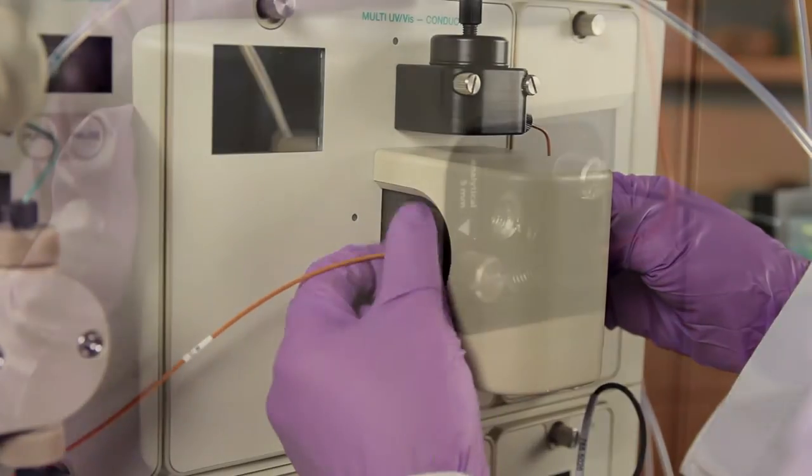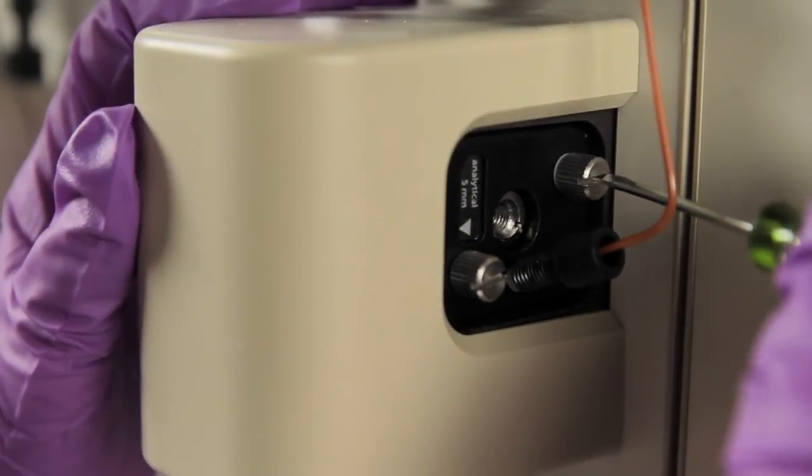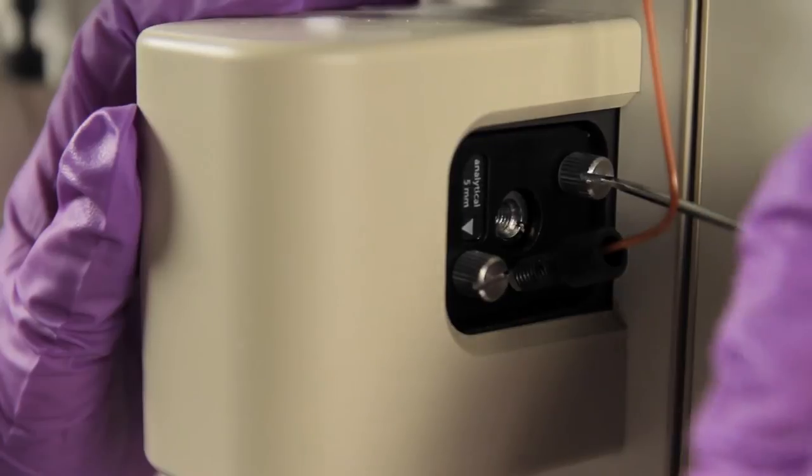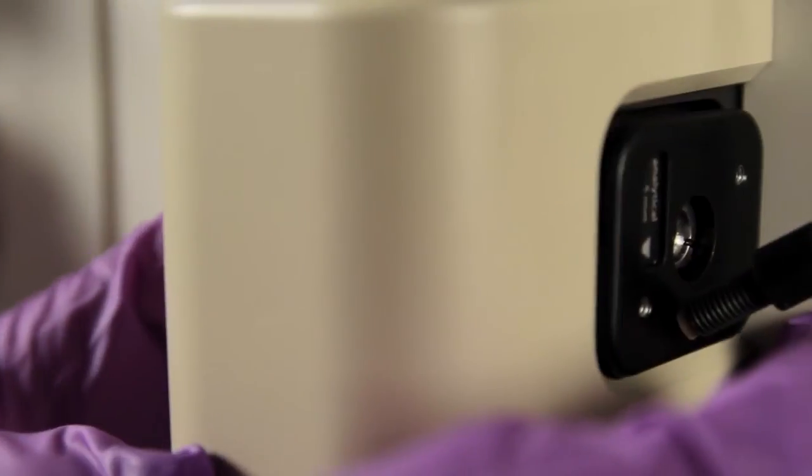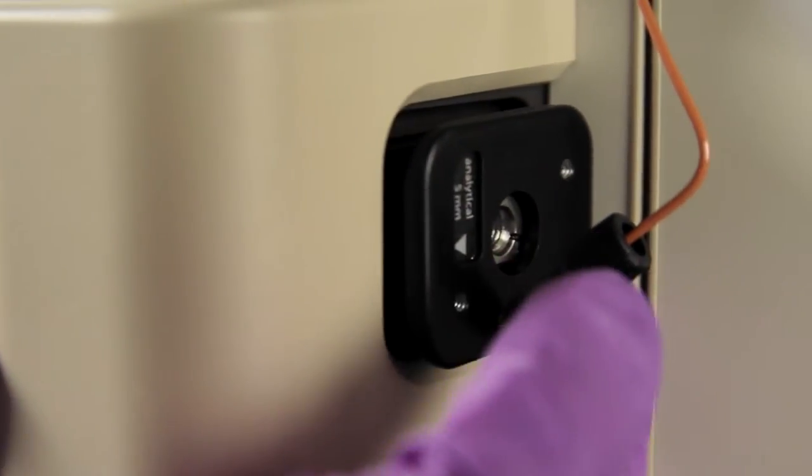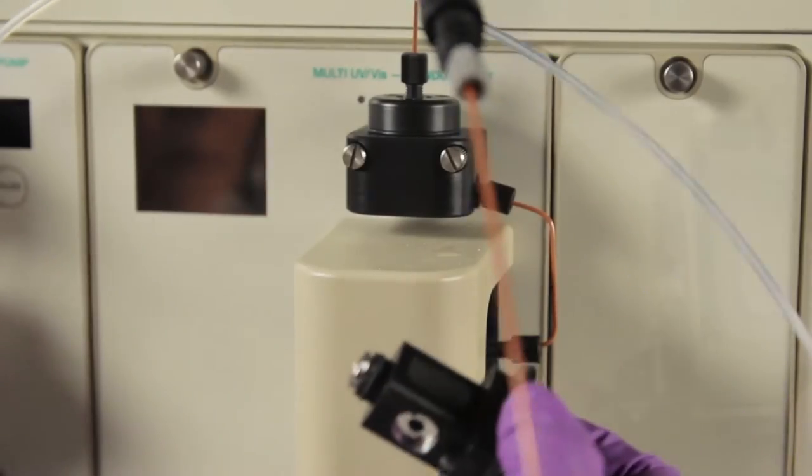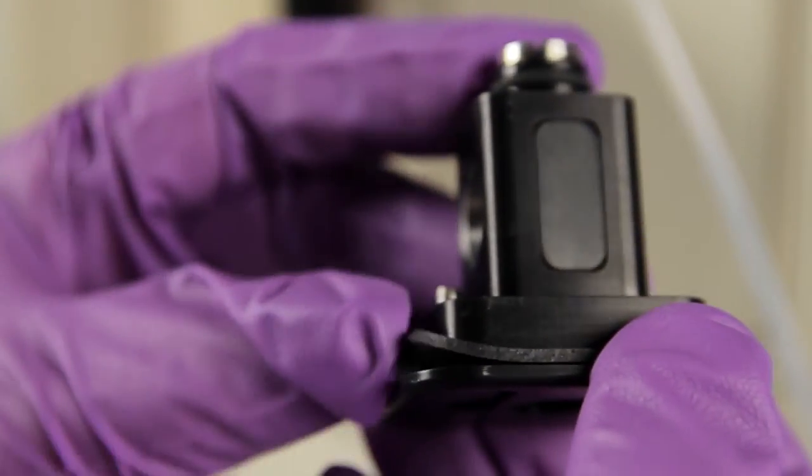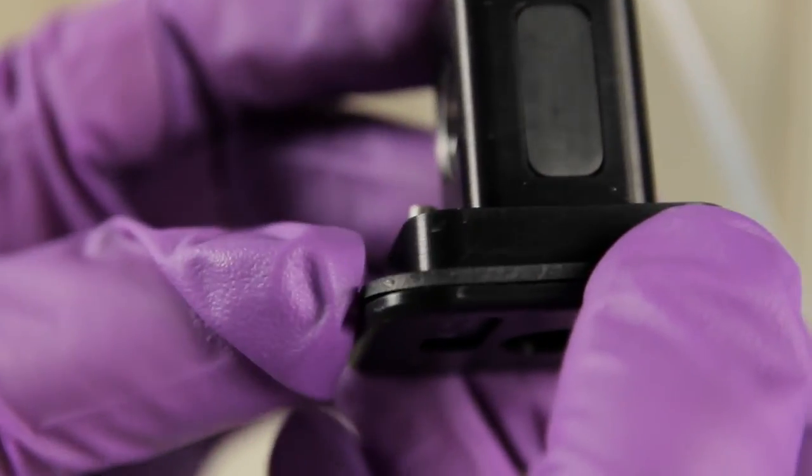Using the screwdriver supplied in the fittings kit, loosen the two thumb screws holding the UV cell and push the flow cell to the right to remove it from the UV monitor. Verify that the square gasket is removed with the flow cell.